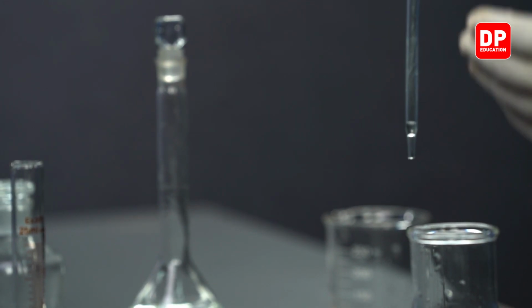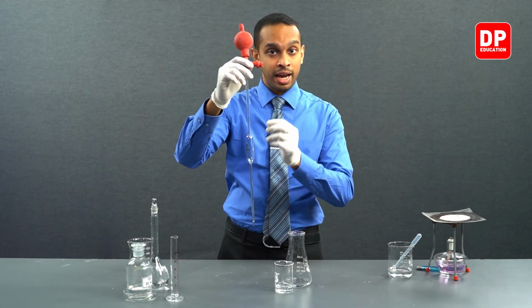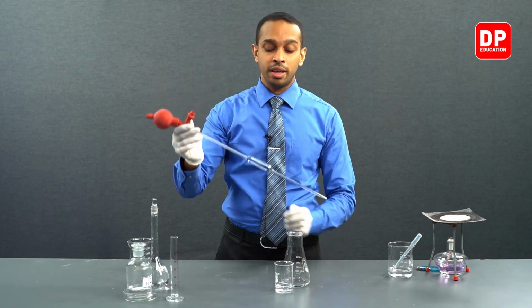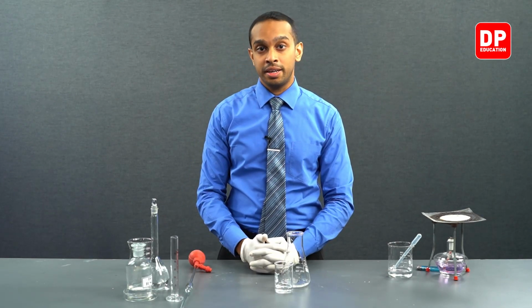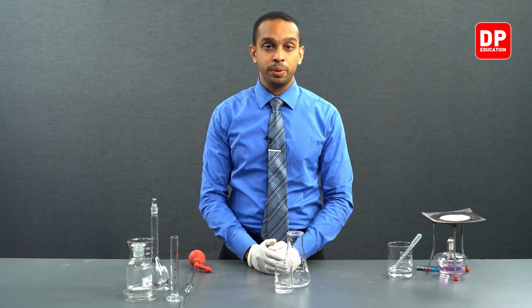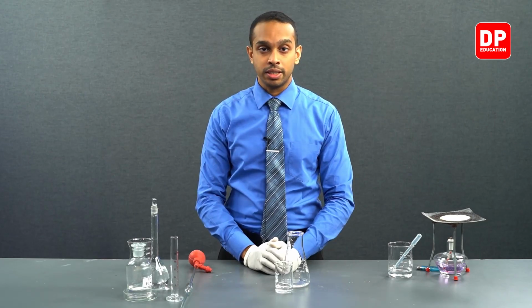So do not force it into the titration flask. If you do that, there will be an additional drop added to your titration flask, and it will give you a measurement that has a significant error in it. So we do not want that to happen. So please make sure that you don't force that droplet into your titration flask.